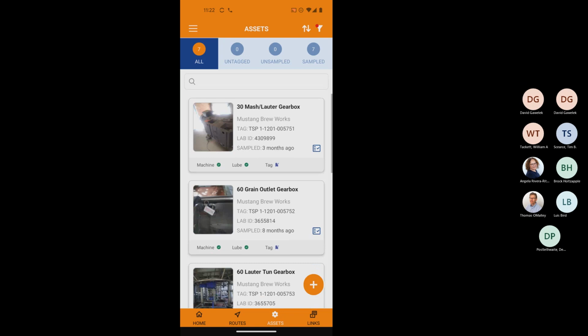Routes are pretty easy to populate. If you are interested, if you go to DataSite and go to the help section, there's a little video that shows you how all the different functions work, and routes is one of those functions. But you can also email me after this, and I can direct you on how routes work. So we talked about linking. We talked about organizing the work.